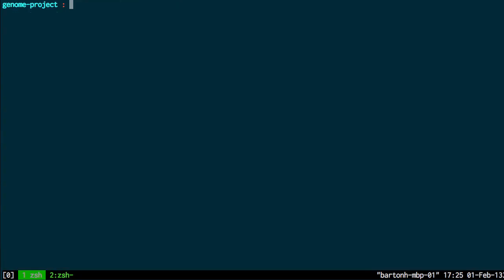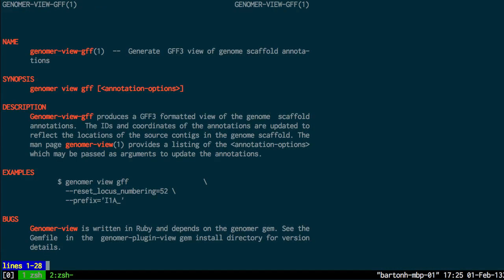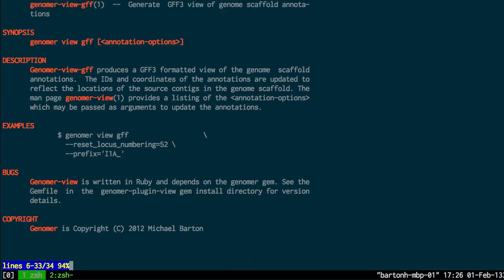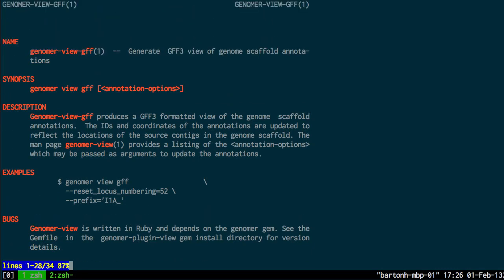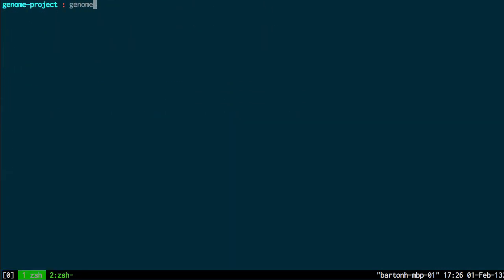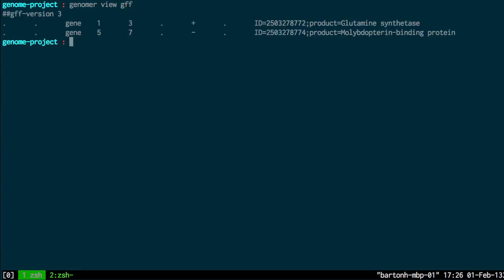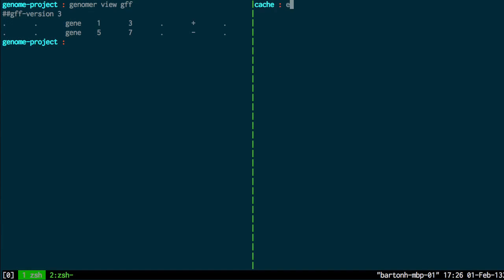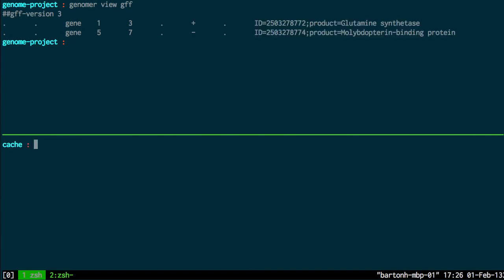And if I quit out of there, the plugin for the annotations GFF3 view, as you might expect, is Genoma man view GFF. And so this gives you GFF3 format annotations. So assuming that I've added that all in correctly, I can now do Genoma view GFF. And that will generate the annotations.